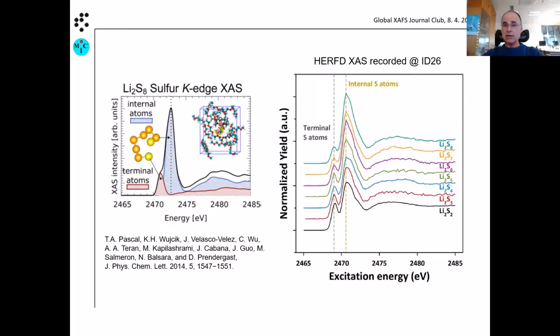And we have done, of course, also the measurements. So this is collaborative work with the people from CEA, from Grenoble. They have provided these polysulfide standards in solution now, so the closest approximation to the real stuff. And you can see, of course, that you now have a nice systematics of this peak.